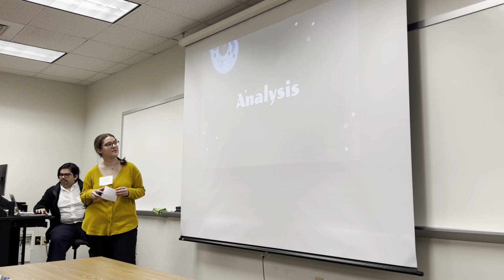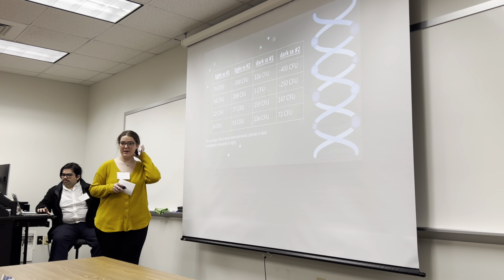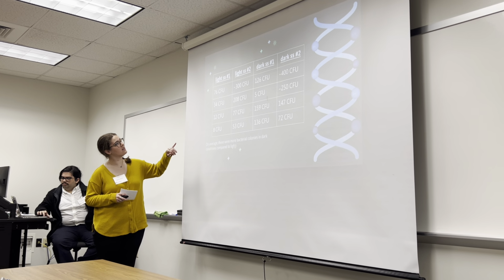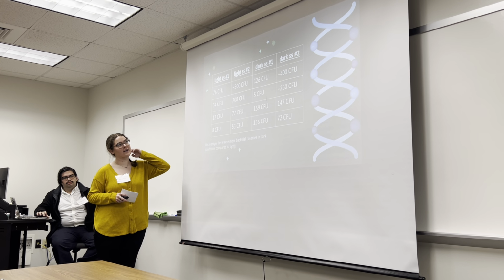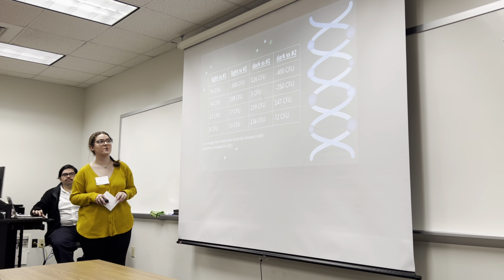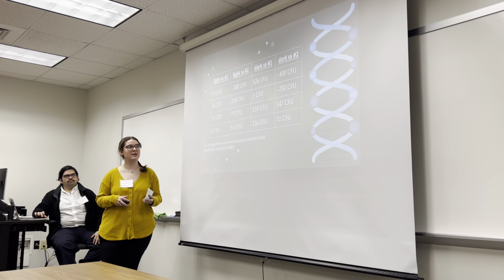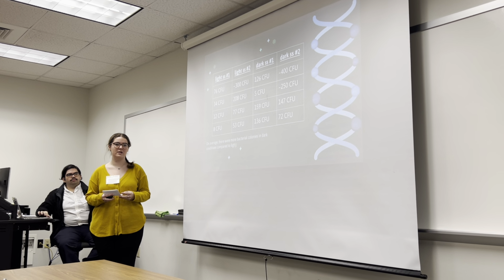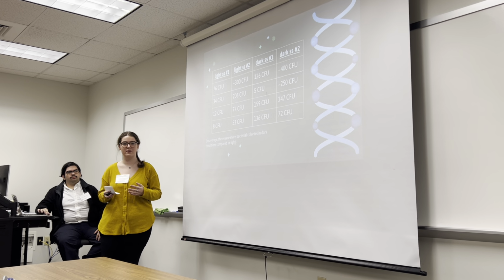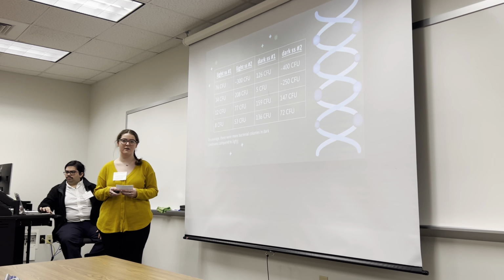And so my analysis is as follows. On average, there were more bacterial colonies in the dark conditions compared to light. The average for light soil sample plates was around 95, and the average for dark soil sample plates was around 160. So this did support my hypothesis that dark conditions would have a difference from the light conditions. However, I would like to do more tests because I had a low amount of testing that I was able to do.